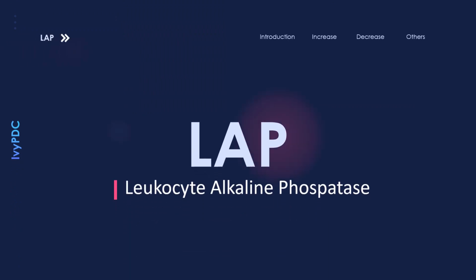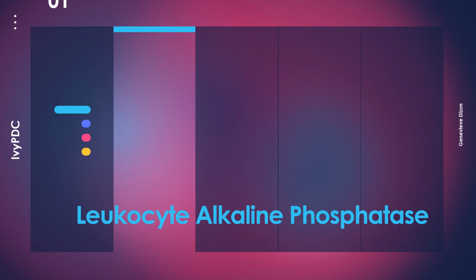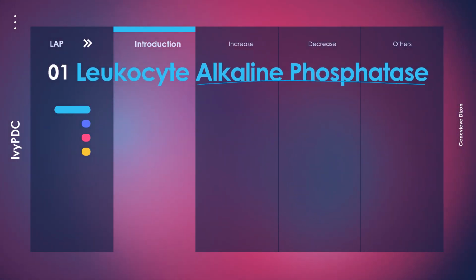Let's now proceed with the first cytochemical stain, which is the leukocyte alkaline phosphatase, or abbreviated as LAP. Alkaline phosphatase, or ALP, pertains to the enzyme that can remove the phosphate group from a molecule. Alkaline because this is the environment where this enzyme is stable and works at its best. ALP may be found in different kinds of tissues, but the ALP that we are interested in cytochemistry is found in a specific cell, which is the leukocyte, which is now known as the LAP.